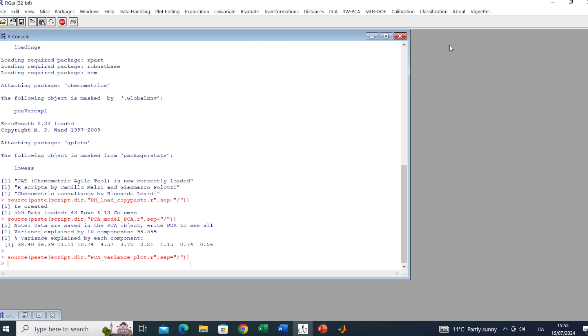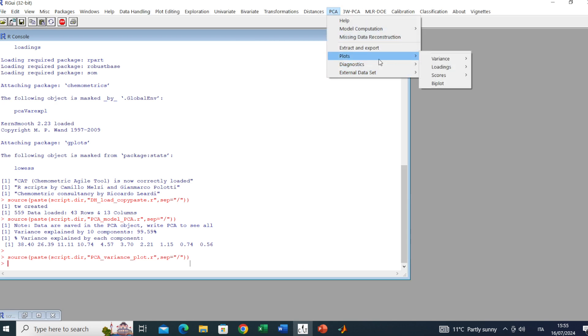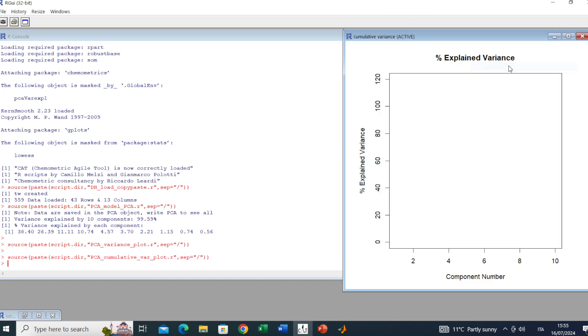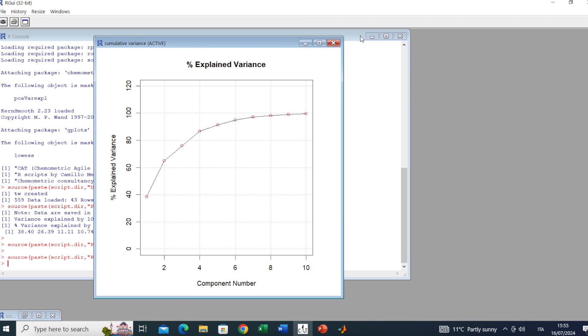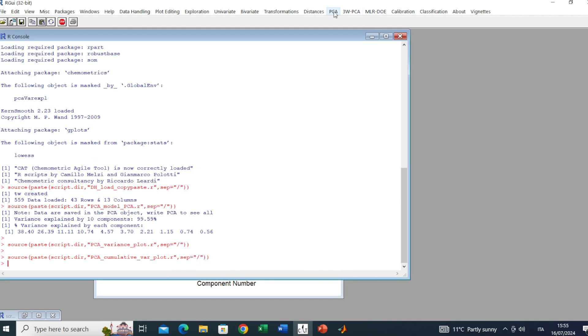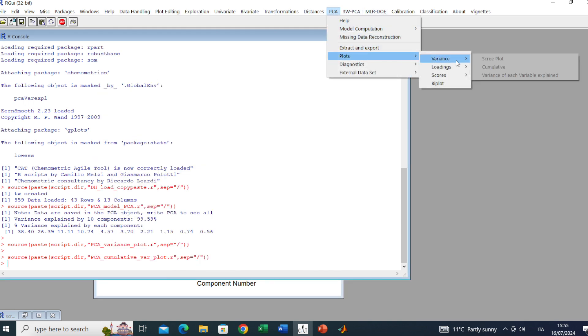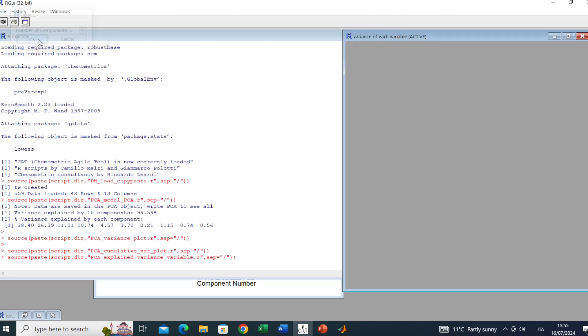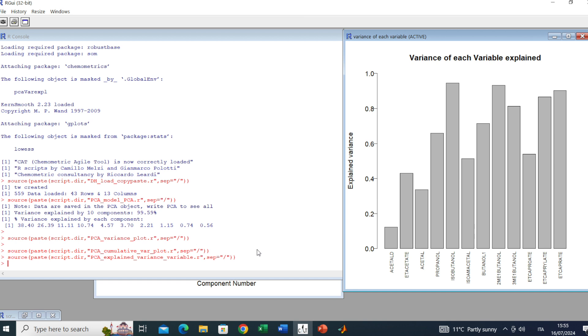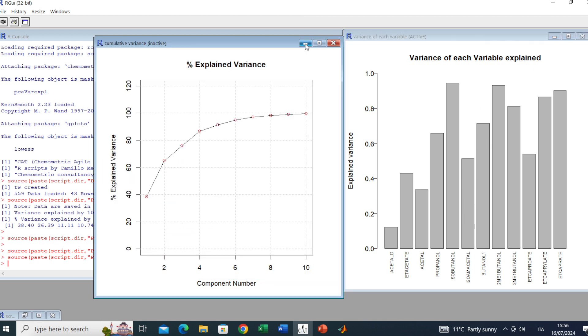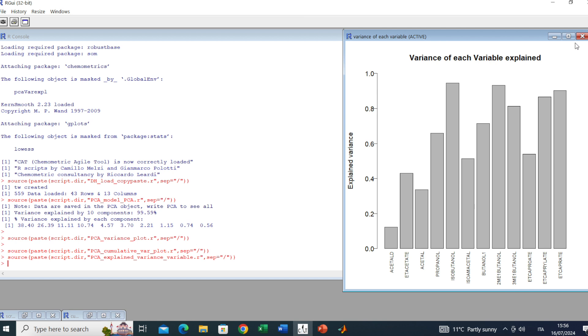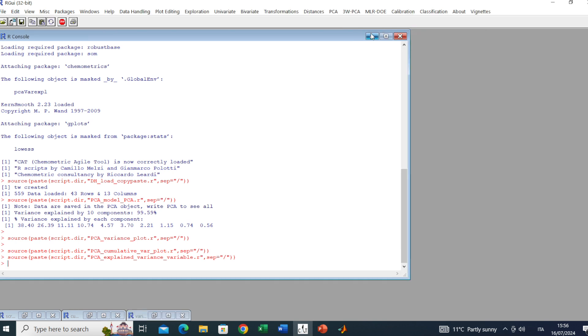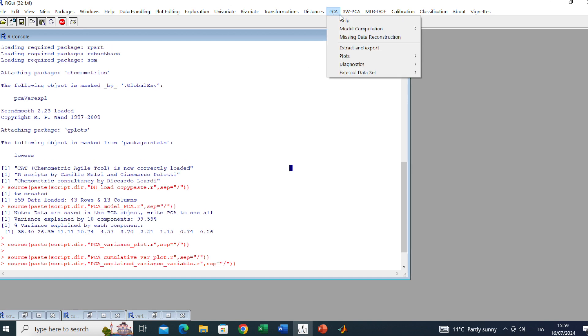Then we have other interesting plots always inside the variance submenu: the cumulative variance, and according to the significant components, the variance of each variable explained. Here you have to select two and you can see the variance explained by each variable.